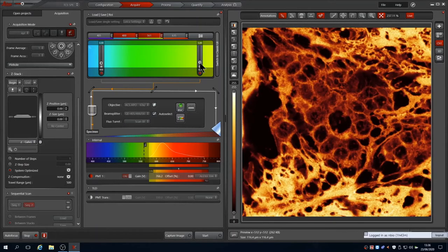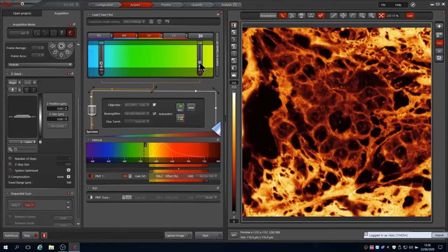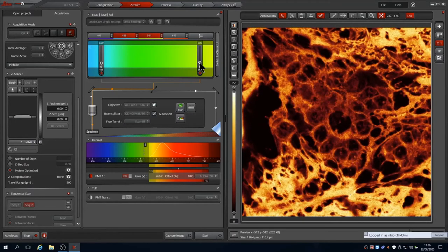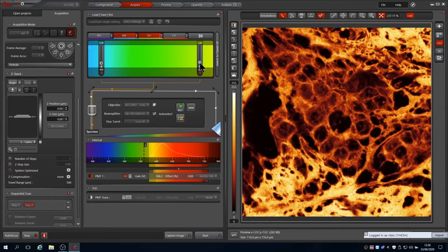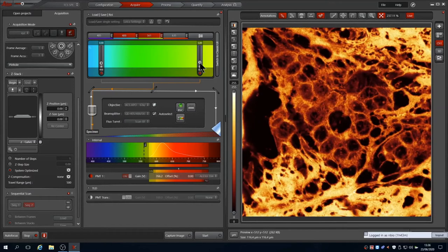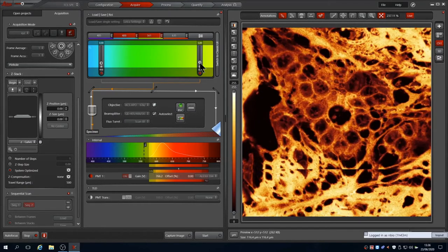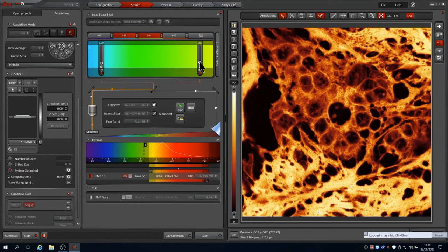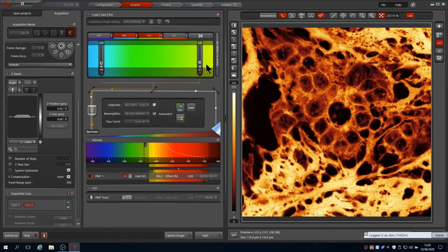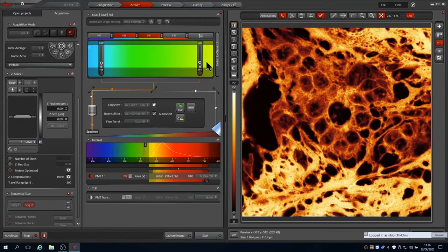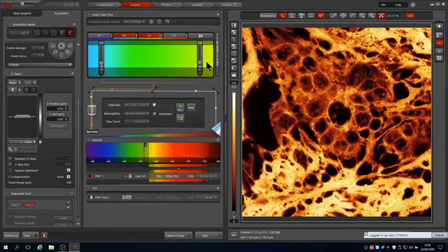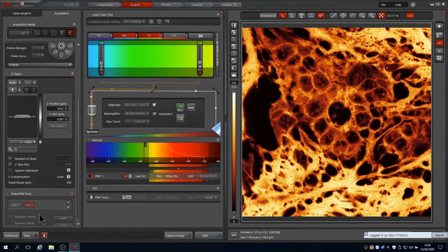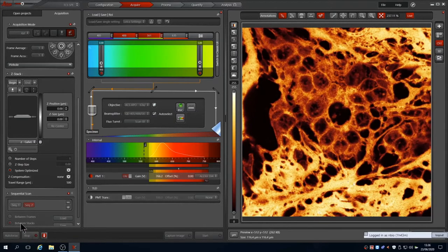Move the stage slightly to check there is no bleaching of the area. This would be visible by a sharp line delineating the scanned area. Finally, tweak the focus until you are happy with it. There is a Galvo Z control map under the monitor that allows very fine control of the stage Z position. Once satisfied, stop the scan and swap to the other sequence. This is 1 in our case.